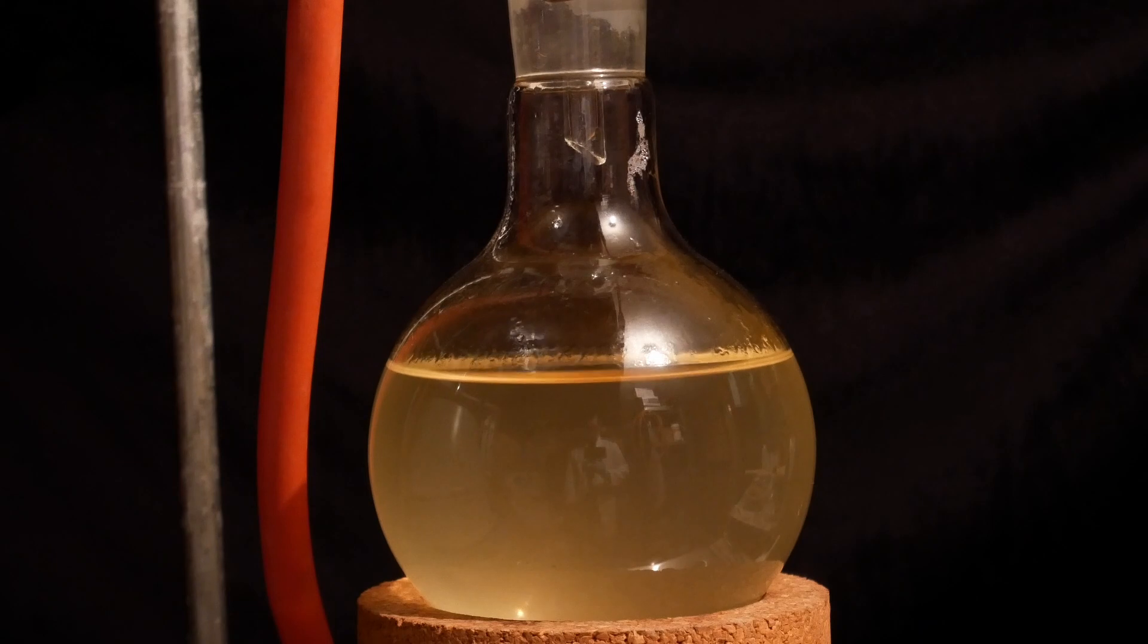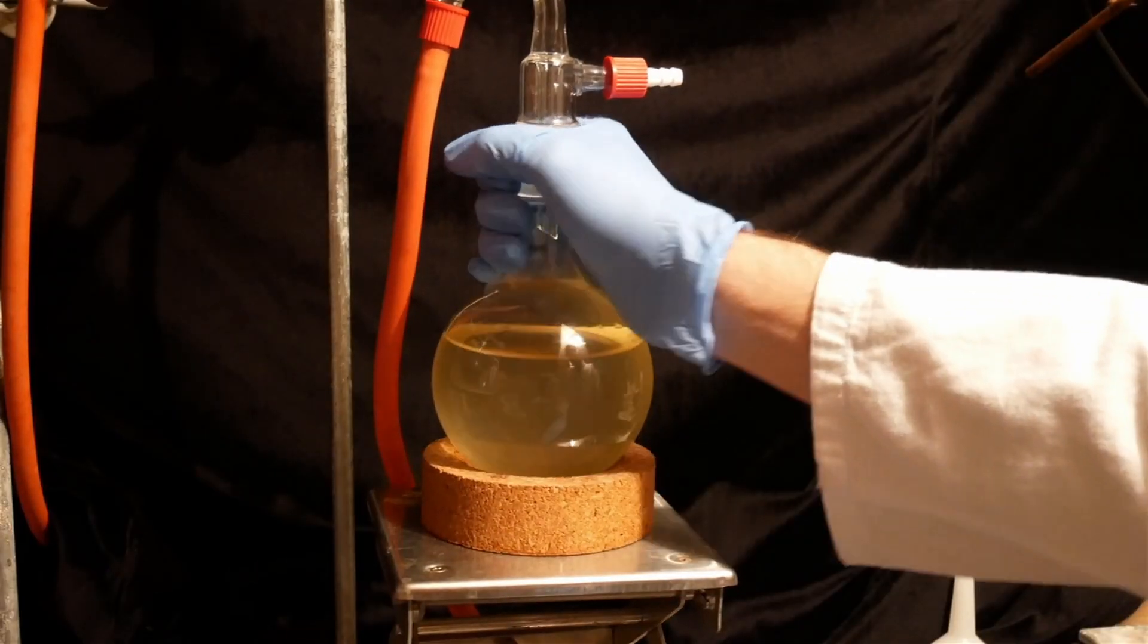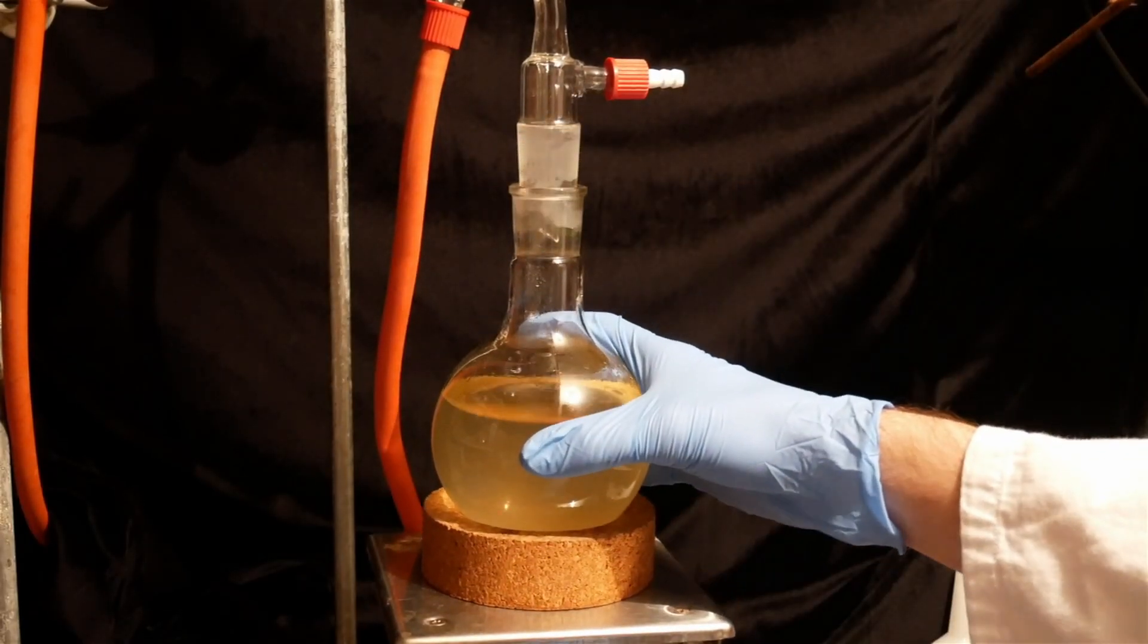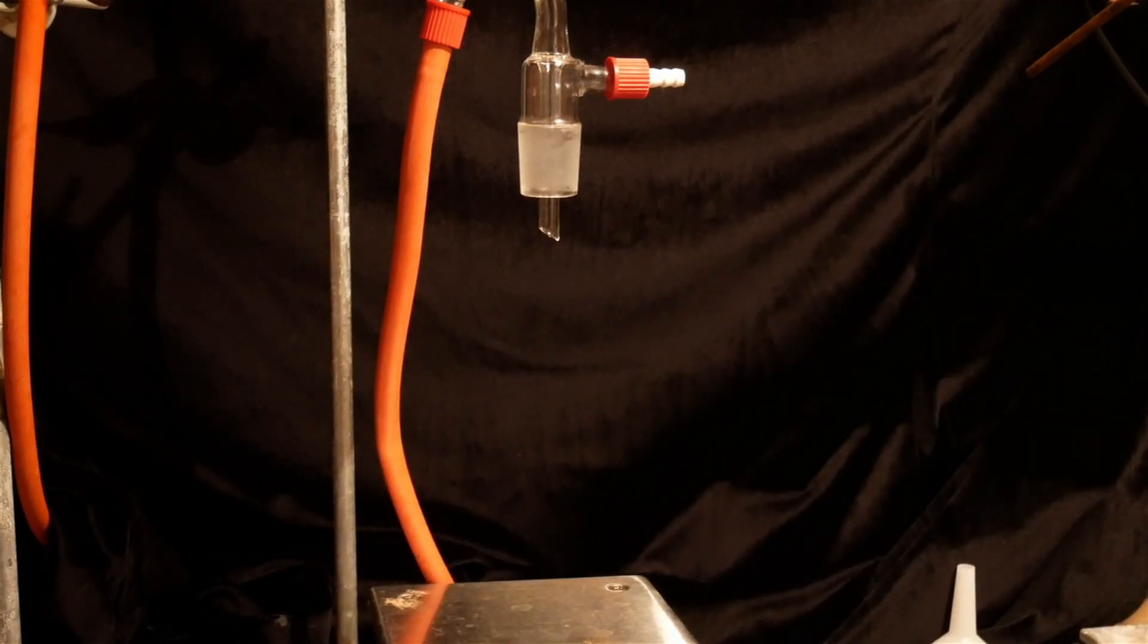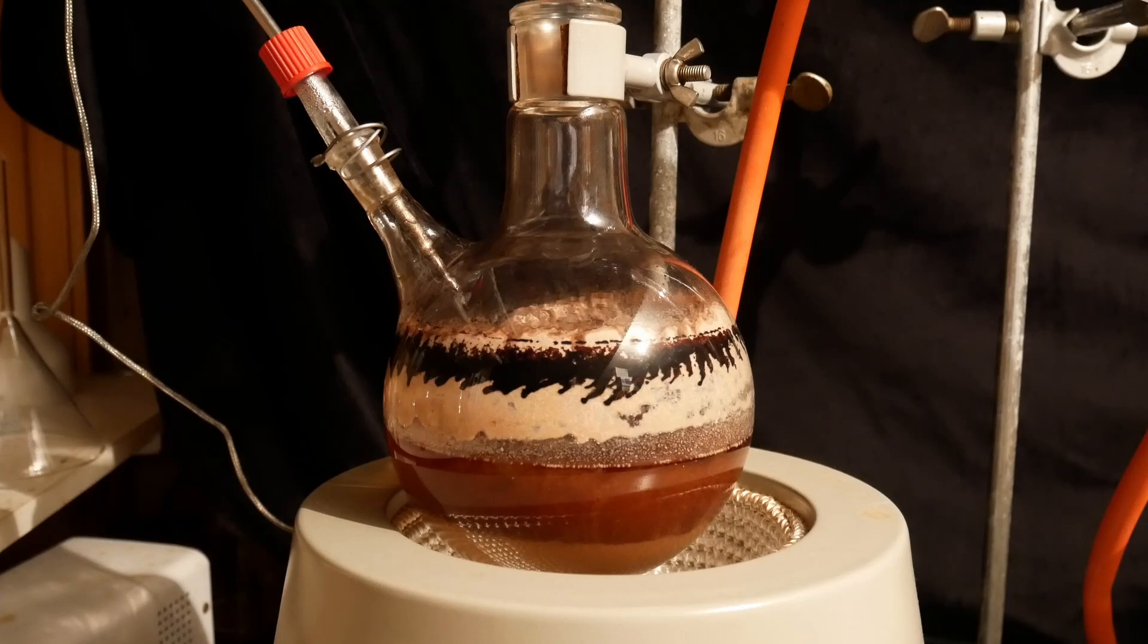To ensure all of the aniline comes over, about 400 milliliters of distillate are collected. There's some water and solid residue left in the flask, which have formed some nice patterns on the glass wall.